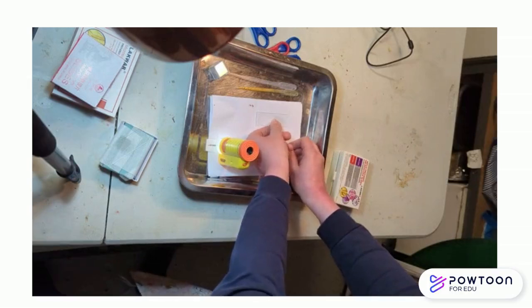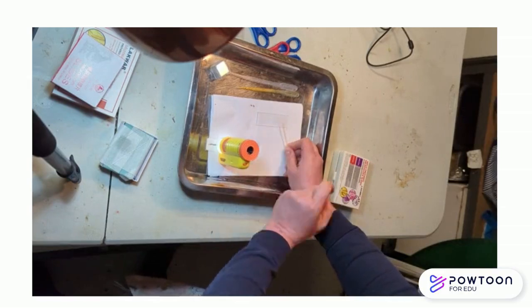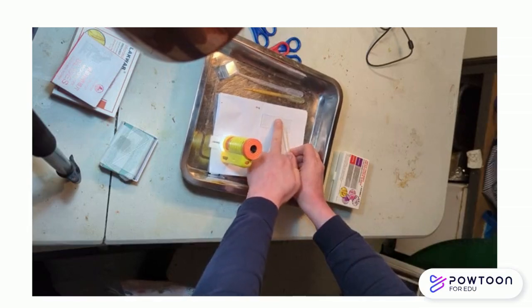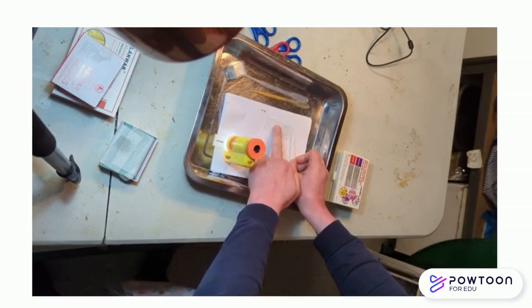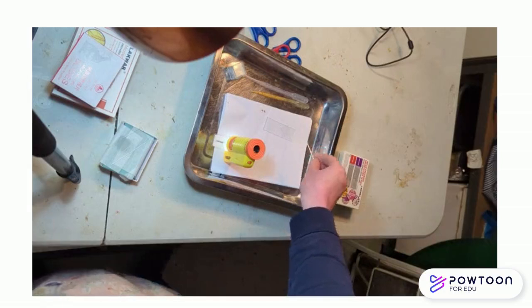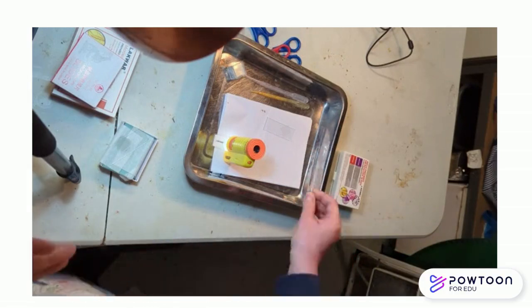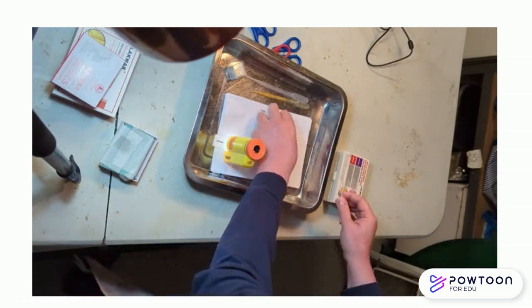Then keep the pointy part of whatever stick you've used holding on to the little cover, and then very, very gently make sure that the cover is on top of whatever. Let's say that here, for example, right in the middle, you've got your little section of skin. So the skin has been stained, the staining agent is already here. You want to make sure there is no air bubble, and this is why you've done this. Let's do this again.